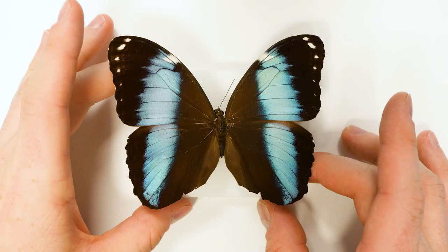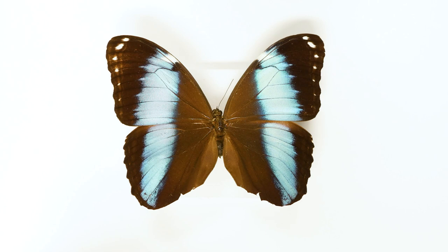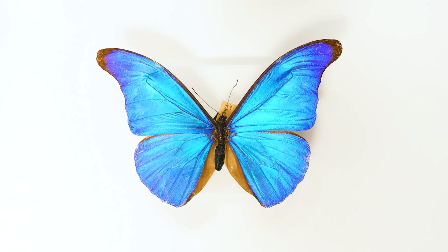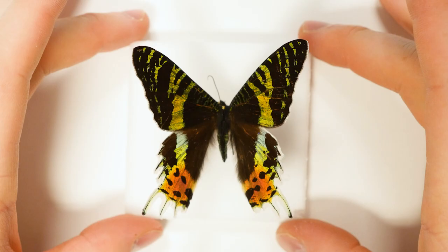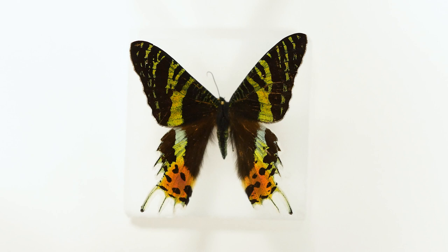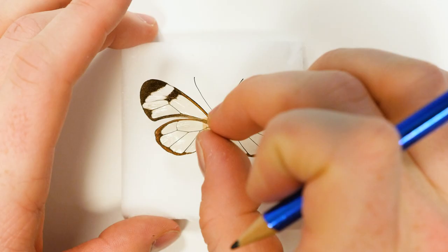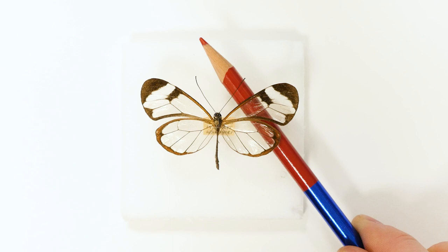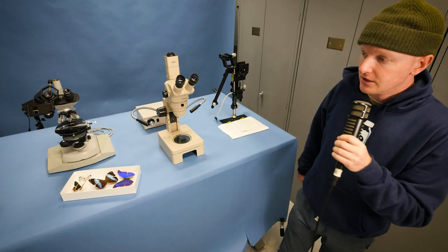We have kind of like a pale blue morpho, kind of like a standard morpho that you might see in a butterfly house. There's the super shiny morpho butterfly. This one is insane. It's glossy. It looks like it's shining. There's a rainbow sunset moth which has all different sorts of colors which might look very strange. And then to top it off there's the glasswing butterfly which I'm most interested in checking out because it has transparent wings. Those are definitely going to look different than the rest which is going to be kind of neat. So let's shut off the lights and get going.